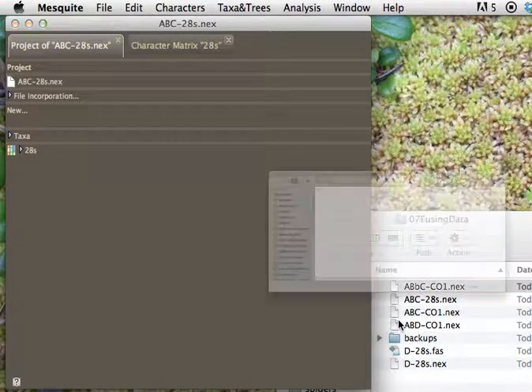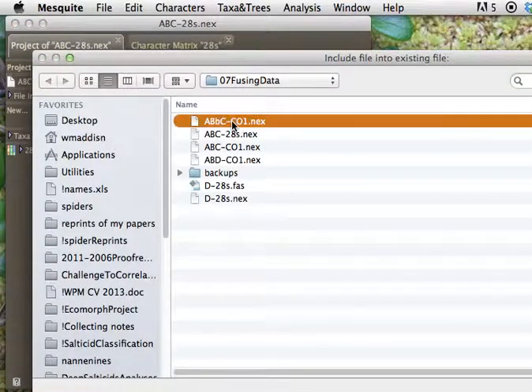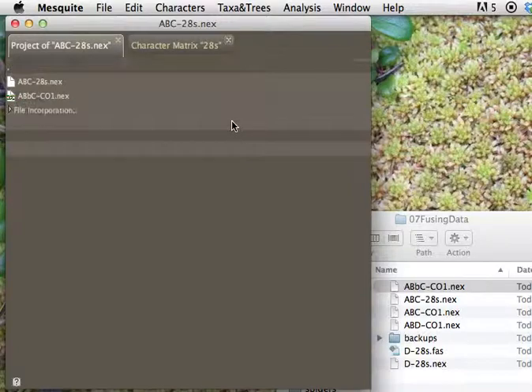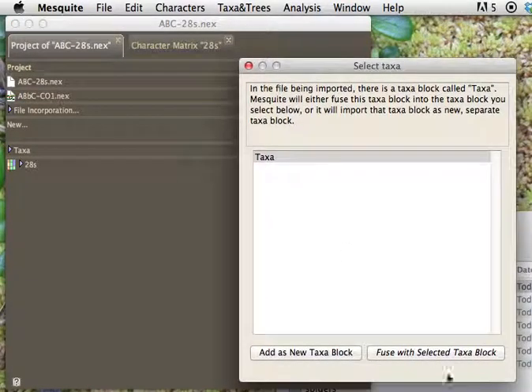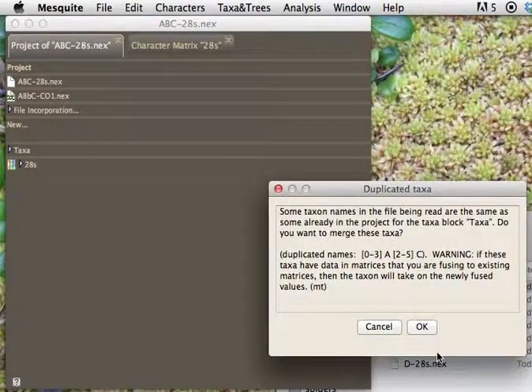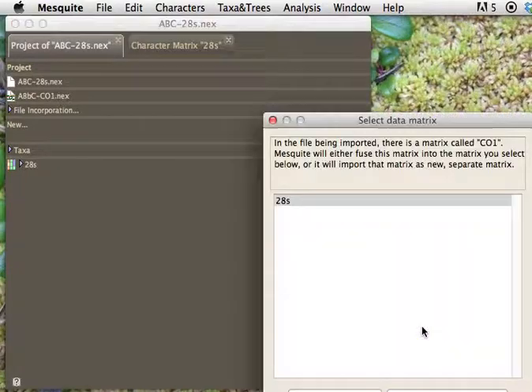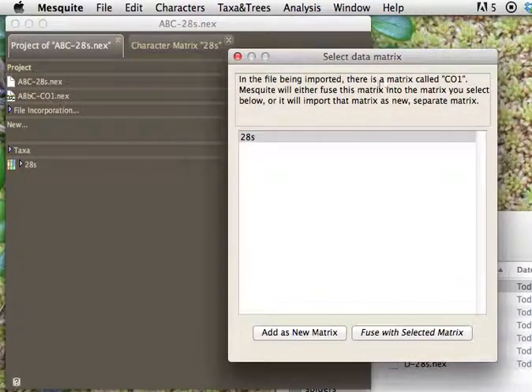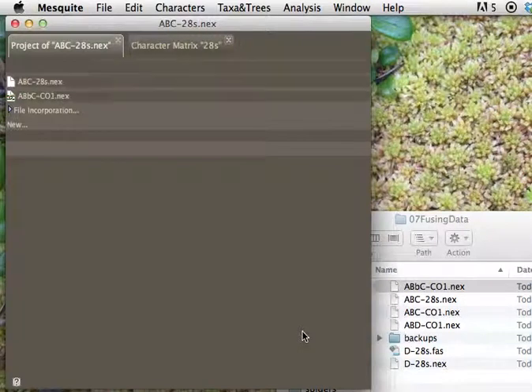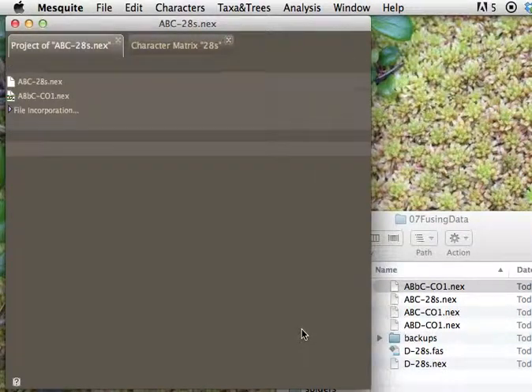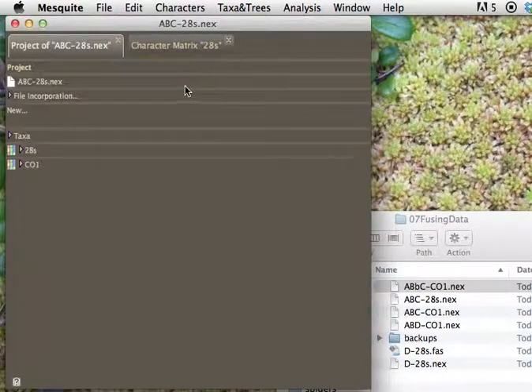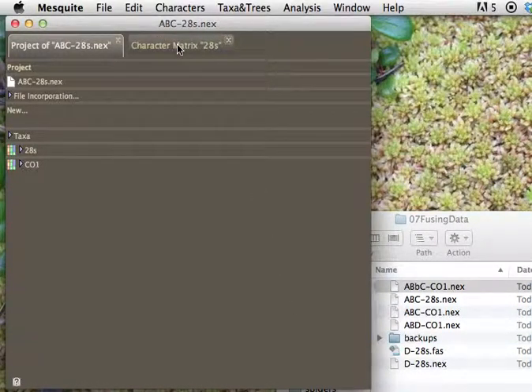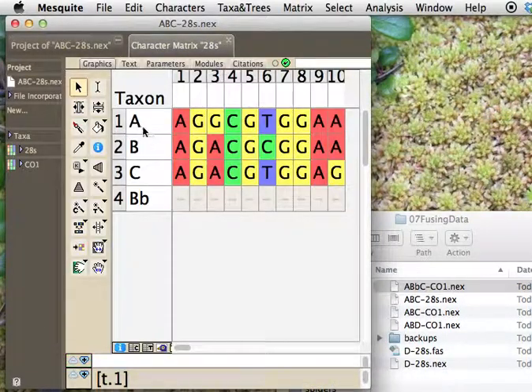So we're going to go back to here, merge taxa and matrices from file. We're going to do the same thing, and we're going to say we want this one, and we are going to fuse the taxa blocks, and this one coming in is CO1. It is duplicated. We expected that. So we're not going to fuse. We're going to add as a new matrix, and everything looks fine.